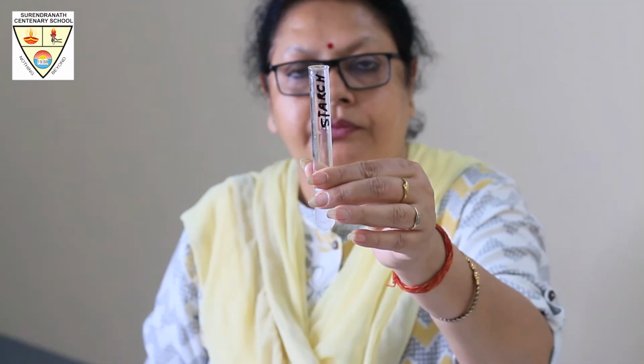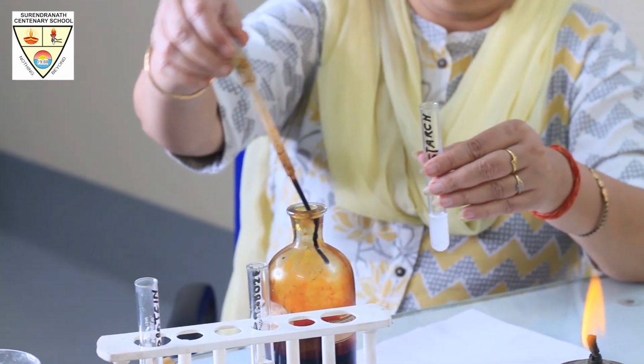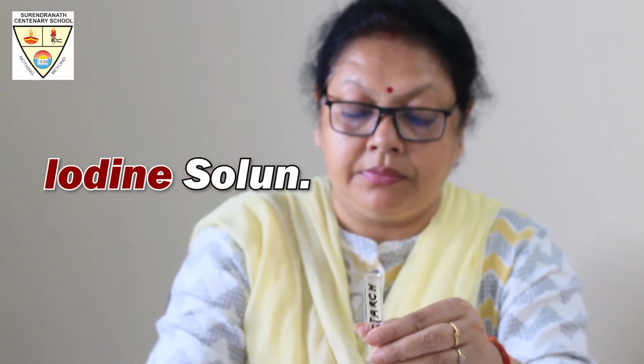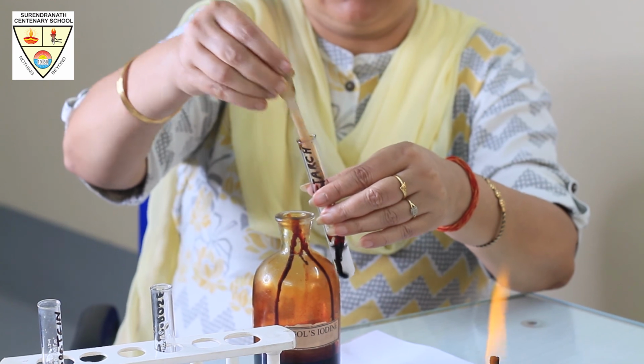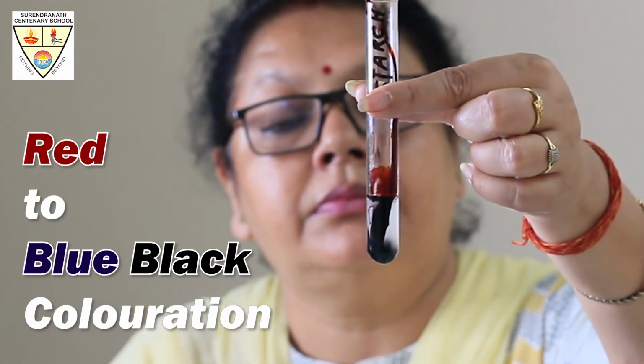Next test is for starch. Boil some potato, take the potato juice, add iodine solution to it, which is red in color. You will immediately see the red color changing into blue-black, confirming the test for starch. That's all.